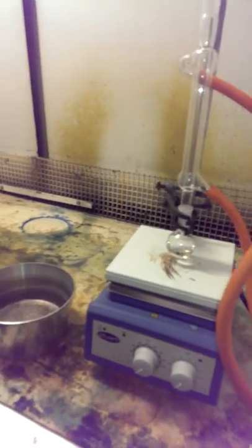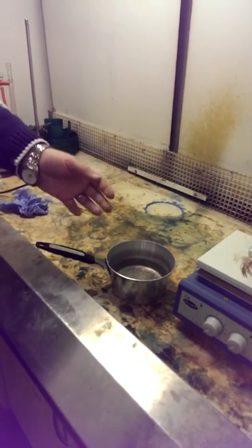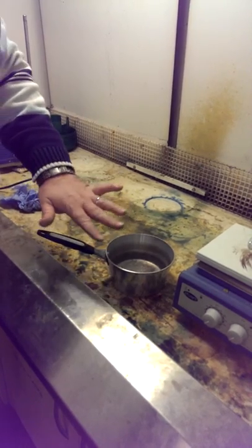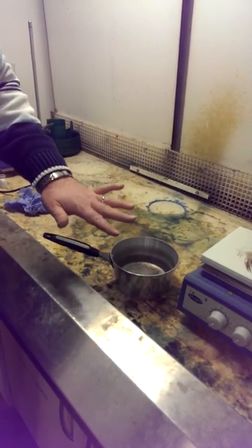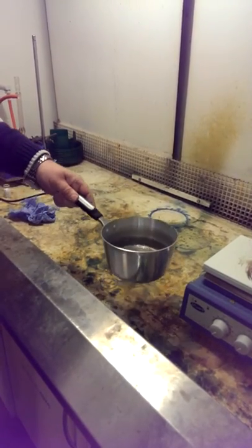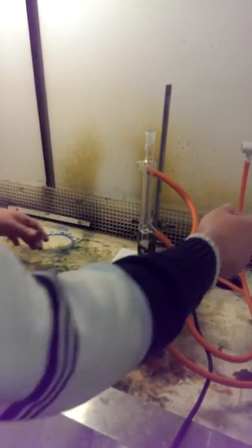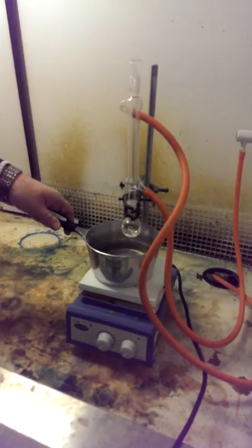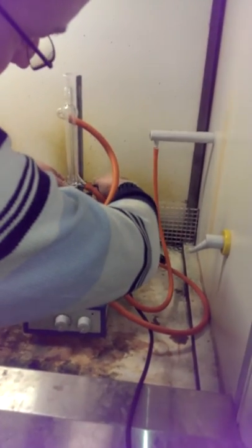We would then encourage the use of a water bath or an oil bath. This is actually a water bath, but sometimes in labs, if you need to be distilling or boiling at temperatures above 100 degrees C, you use a paraffin oil bath. We put it into one of these saucer pans. Water, that is. So lift up, put your water bath into situ, drop the flask down.